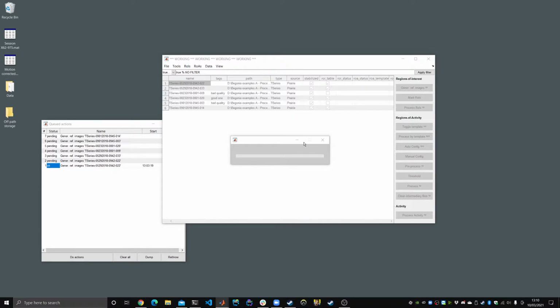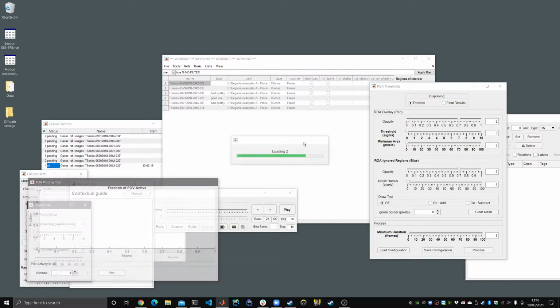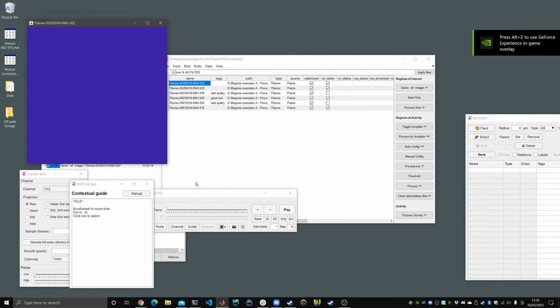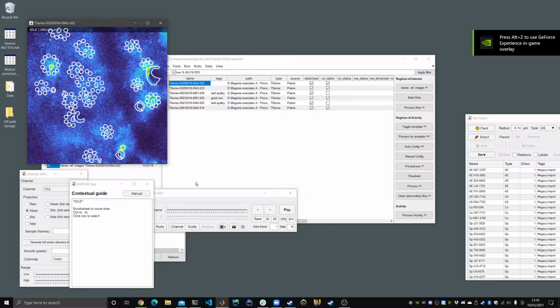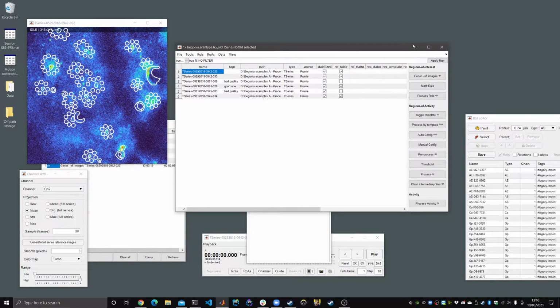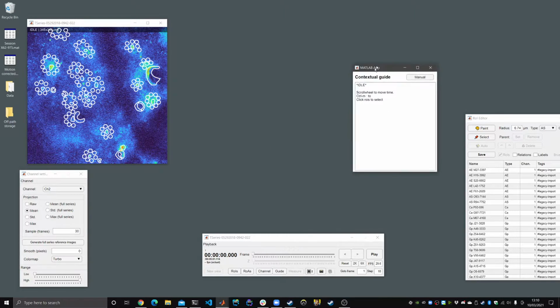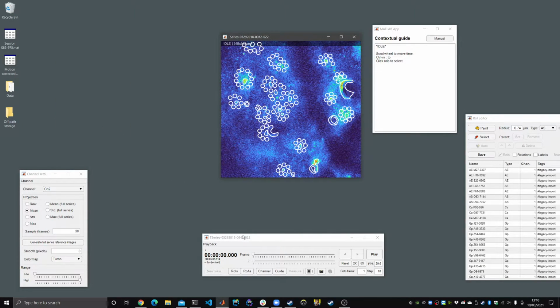This will open the RoI Manager, which is the second program bundled with Begonia. It's a big program, lots of features, but most of these windows that pop in and out will be contextual, so they will open up at a time where they are relevant to what you're seeing on the screen. For now, I'm going to put the data manager away, and the same with the action queue from the data manager, and we'll just look at some of the main windows of this program.